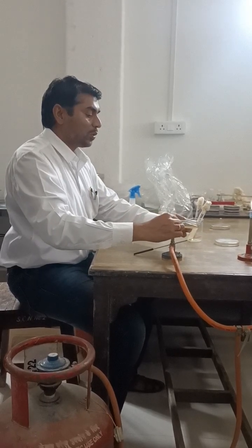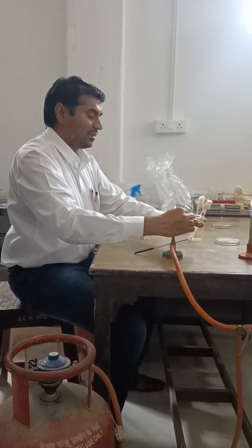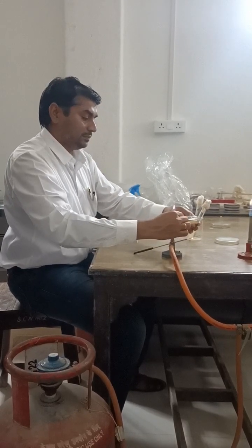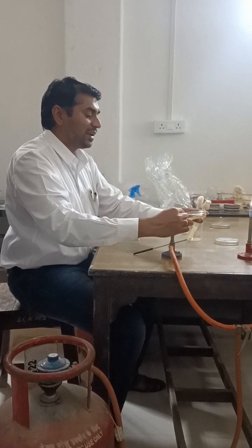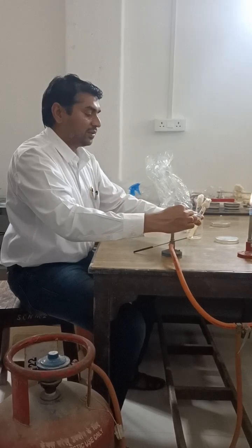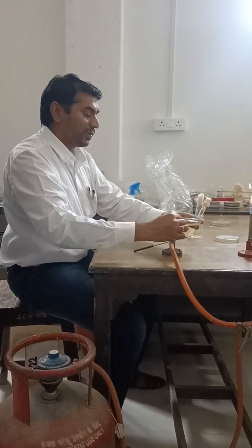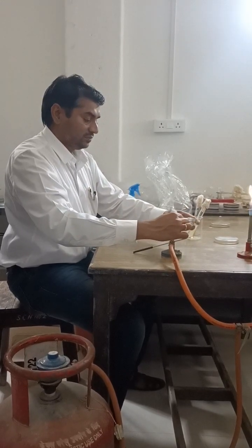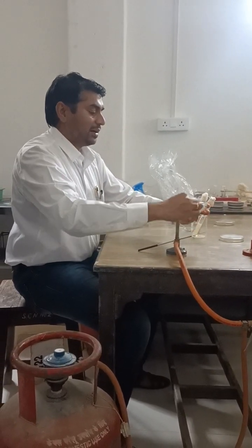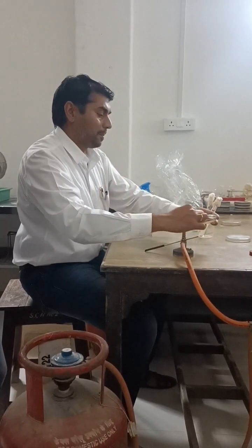Slowly spread the sample using a steel spreader. First spread the sample back and forth, then circularly move the petri plate in your left hand. The process should be done very slowly and carefully so that you do not open the upper lid, in order to prevent contamination.